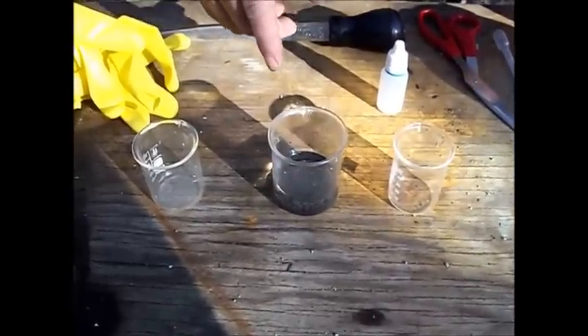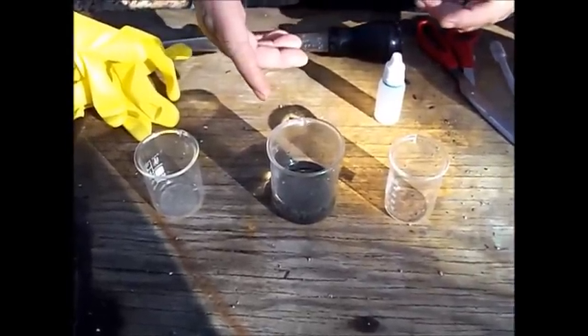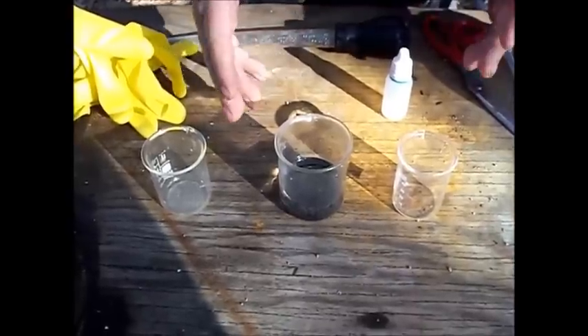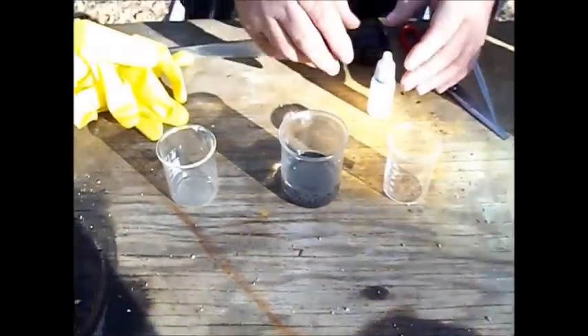The dissolution of the solder is basically pretty much done. There are still a few little bubbles, but it's because it's warmed up in the sunlight and I think there's a little bit more activity going on in there.